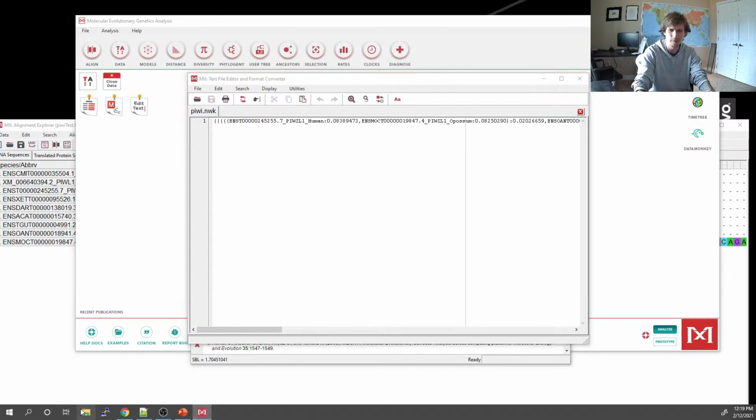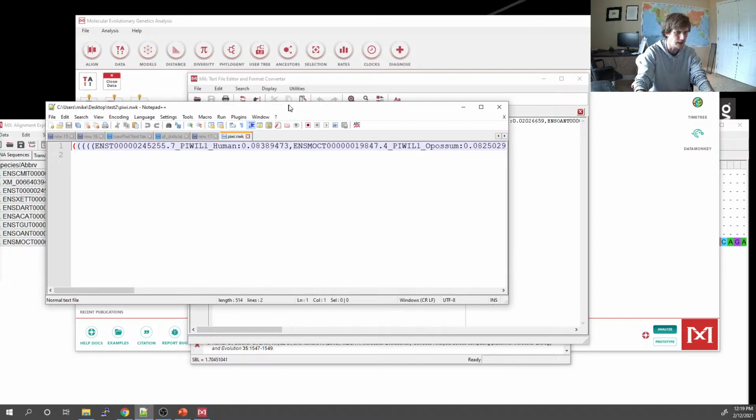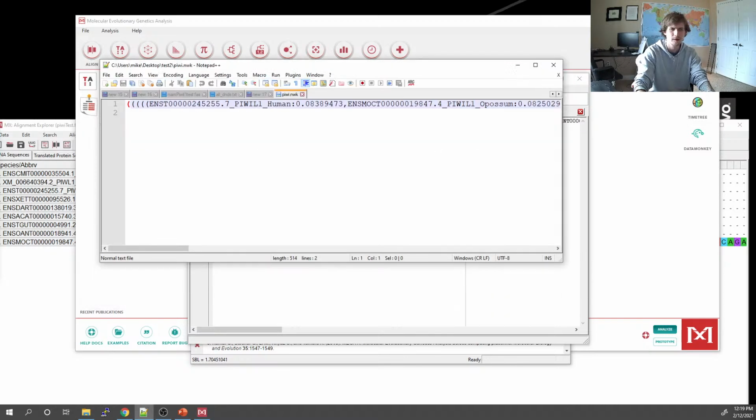And hopefully that will be true whenever I actually look at the text document. A lot of stuff just happened.